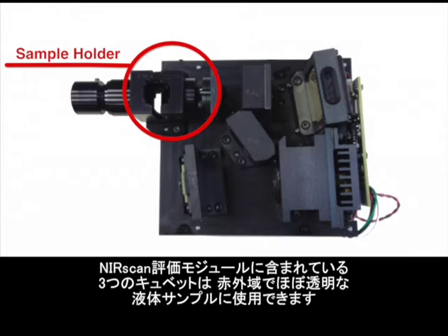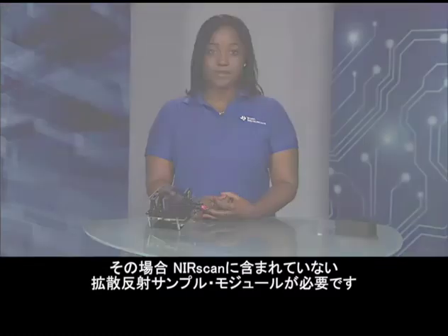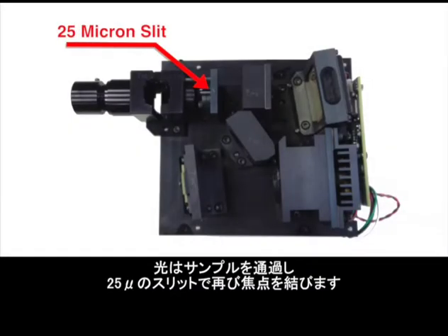The 3 cuvettes included with the NIRscan EVM can be used for liquid samples, which are mostly transparent in the infrared. Diffuse reflectance measurement techniques are used for samples which are usually more opaque. These require a diffuse reflectance sample module, which is not included with the NIRscan. The light passes through the sample and is refocused through a 25-micron slit.